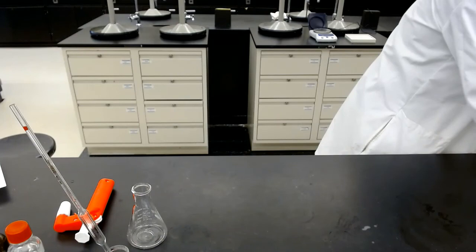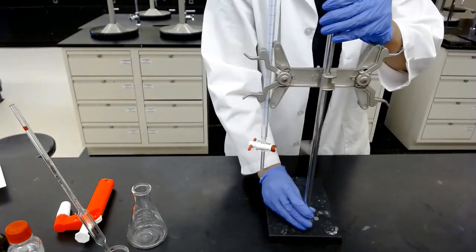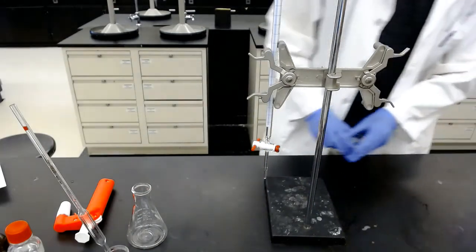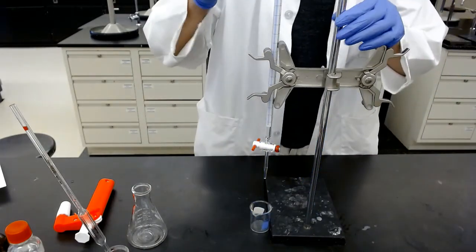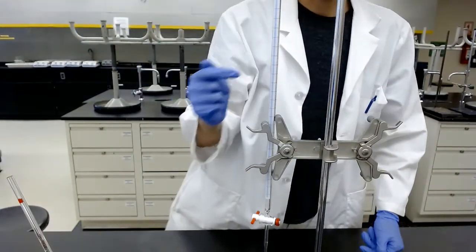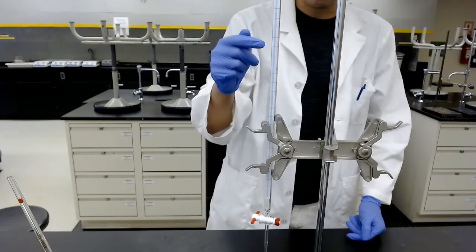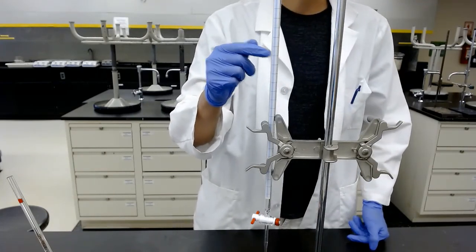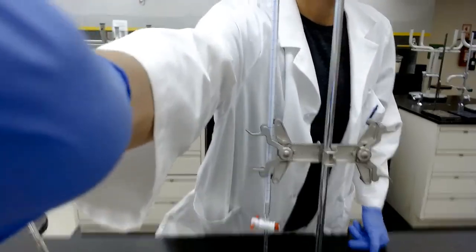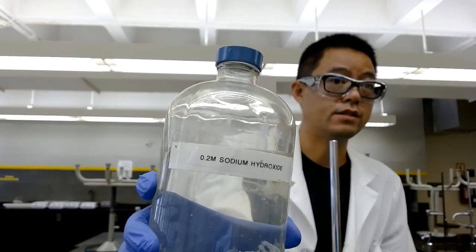And then titration. So this is a titration setup right here. This is the burette, a 25 ml burette. I need to fill it up with the standard 0.2 molar sodium hydroxide aqueous solution.